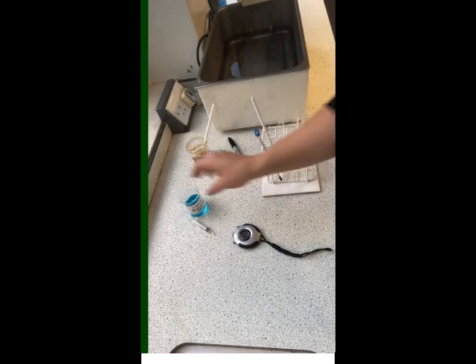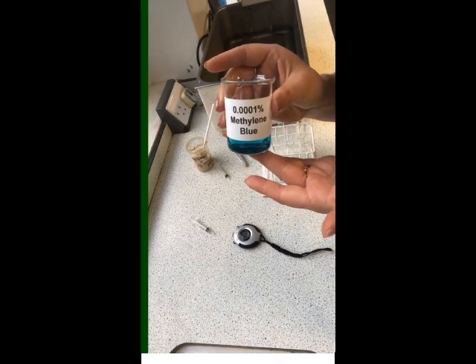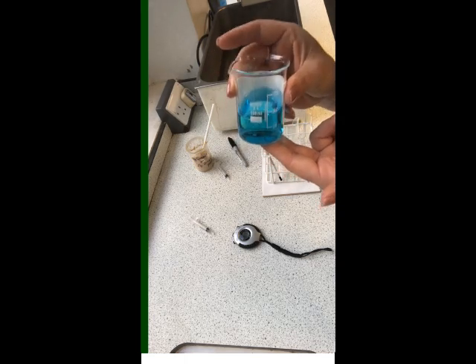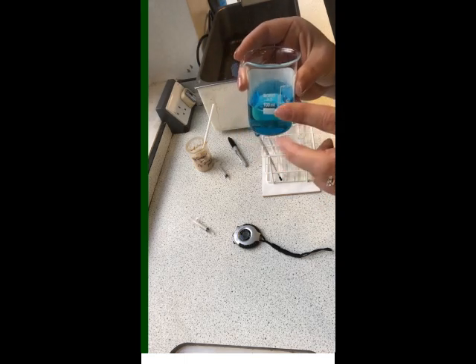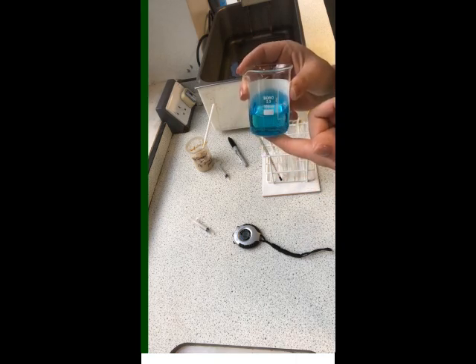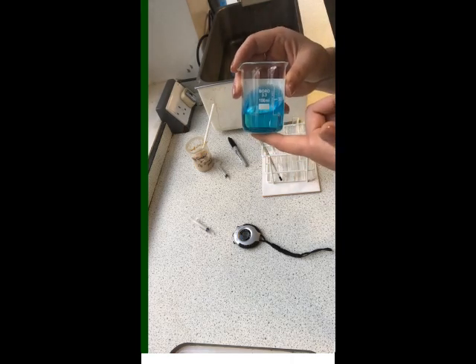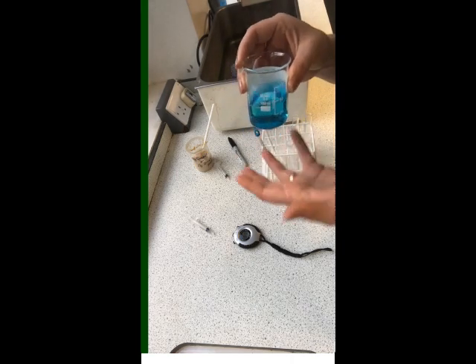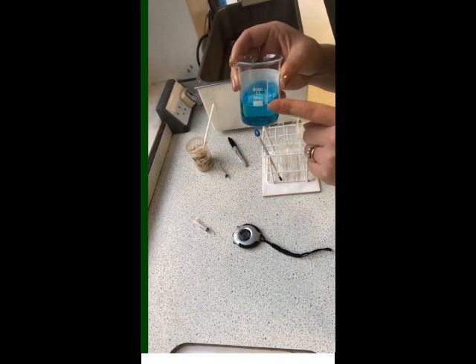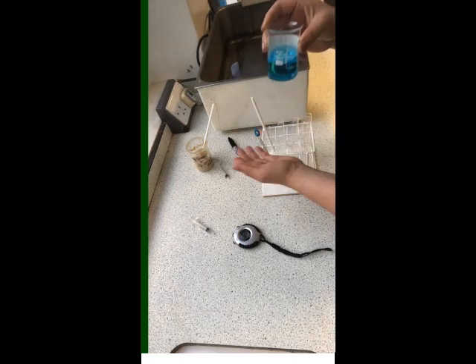And the way that we do this is we use this, which is called methylene blue. Now, methylene blue, as you can tell by its name and also by looking at the video, is a blue substance. Now, what's important about methylene blue is that when it gains electrons, so when it becomes reduced, it actually becomes colourless. So we are going to be able to see how quickly this becomes colourless, and that's going to indicate to us the rate of respiration of yeast.